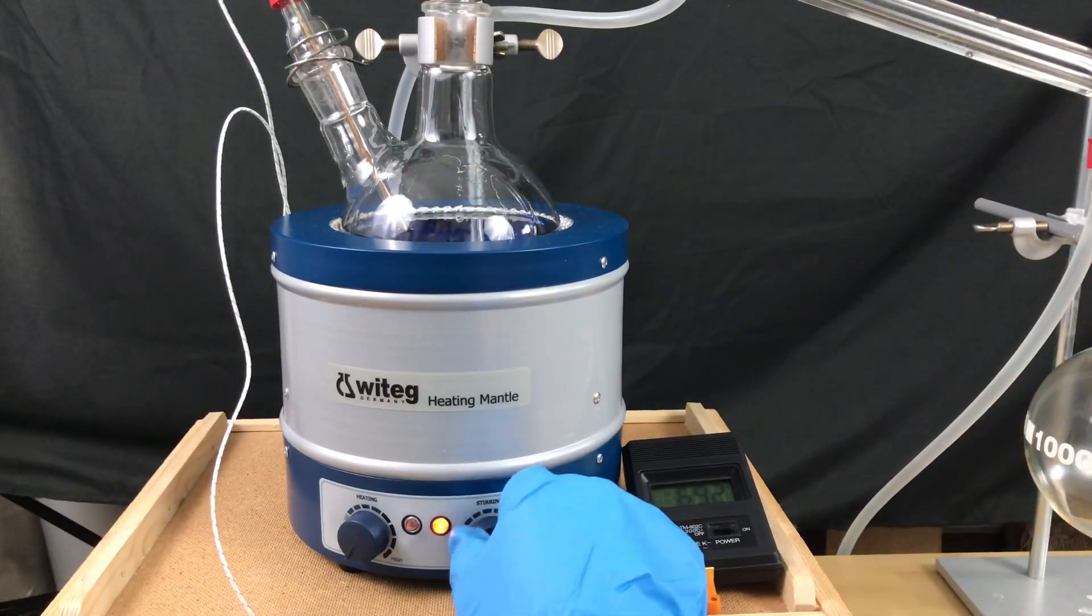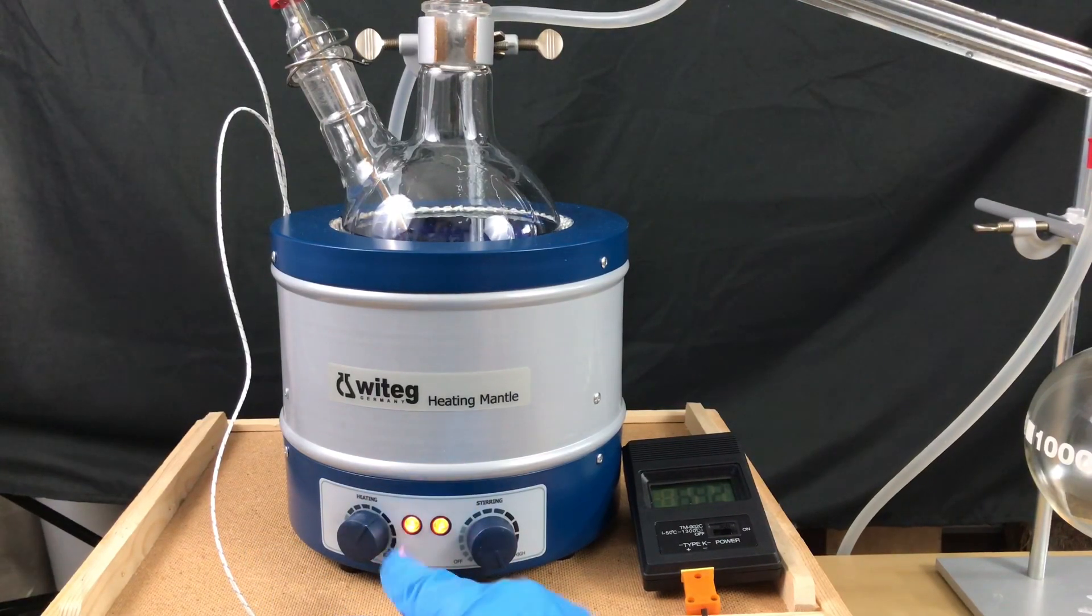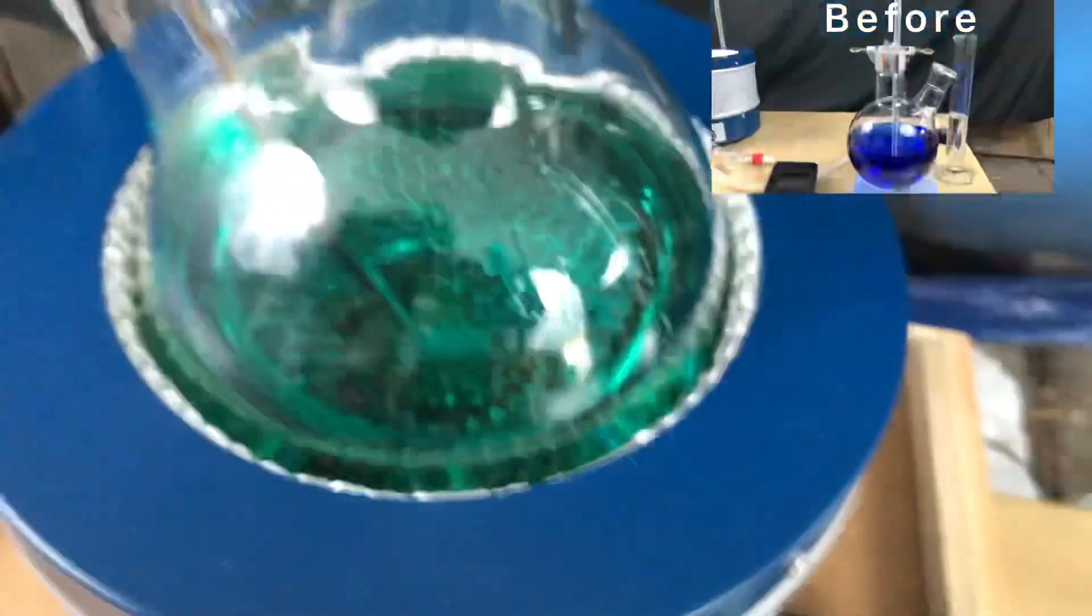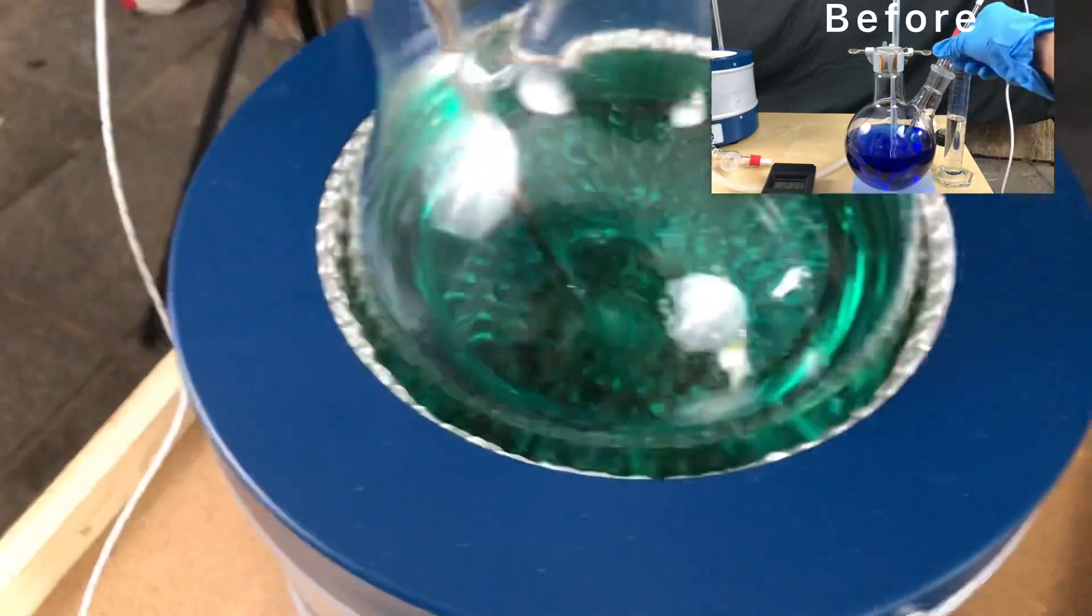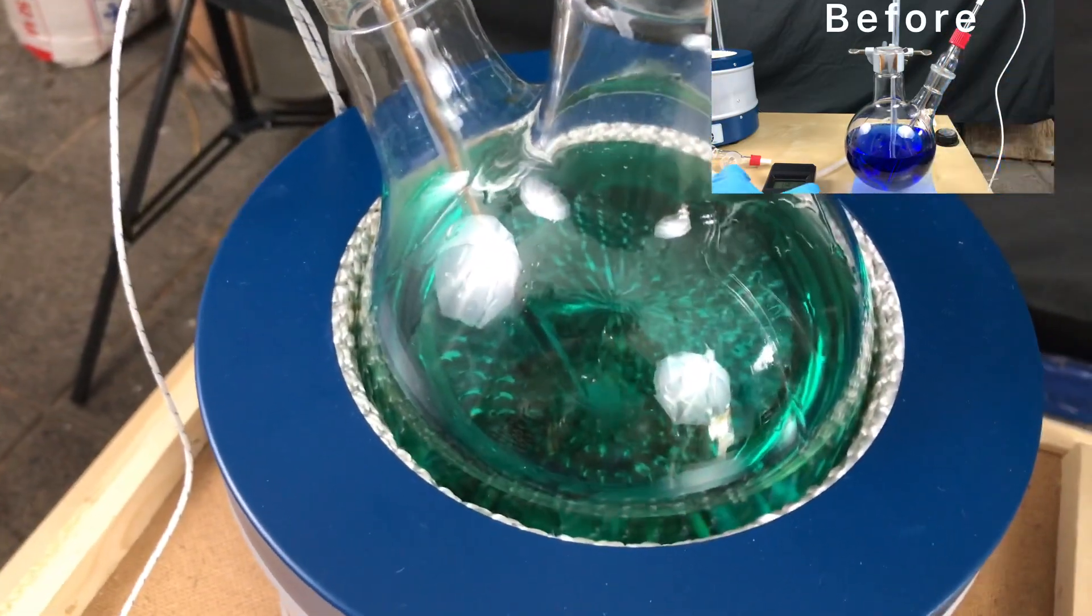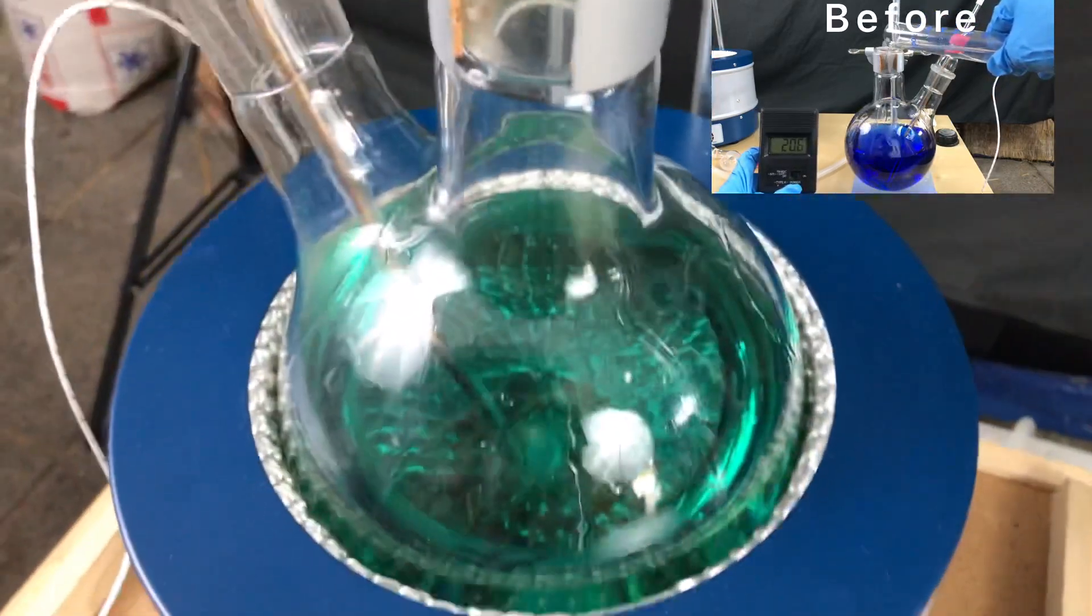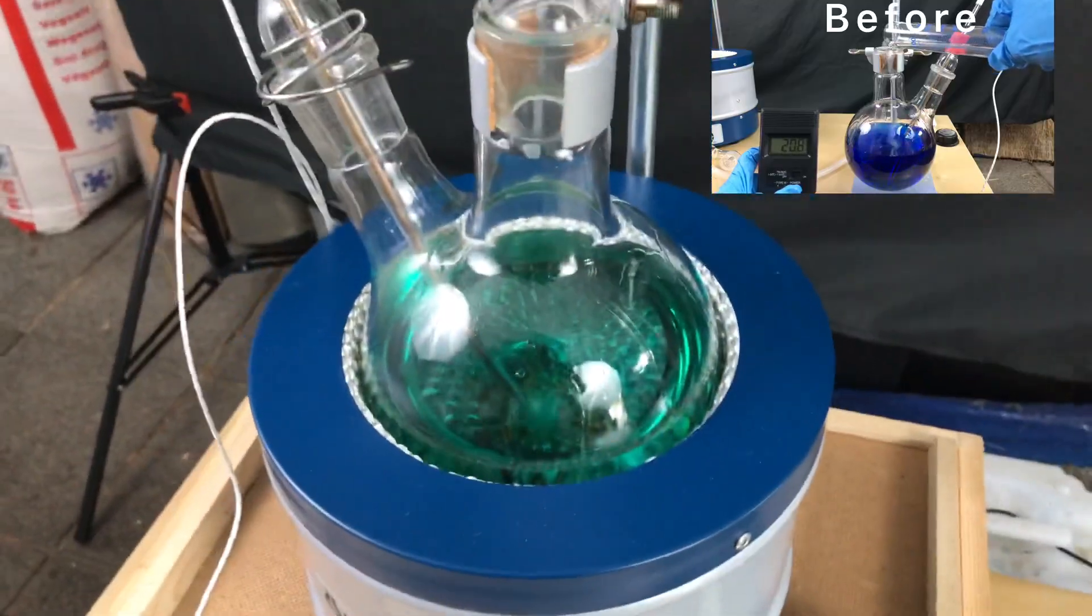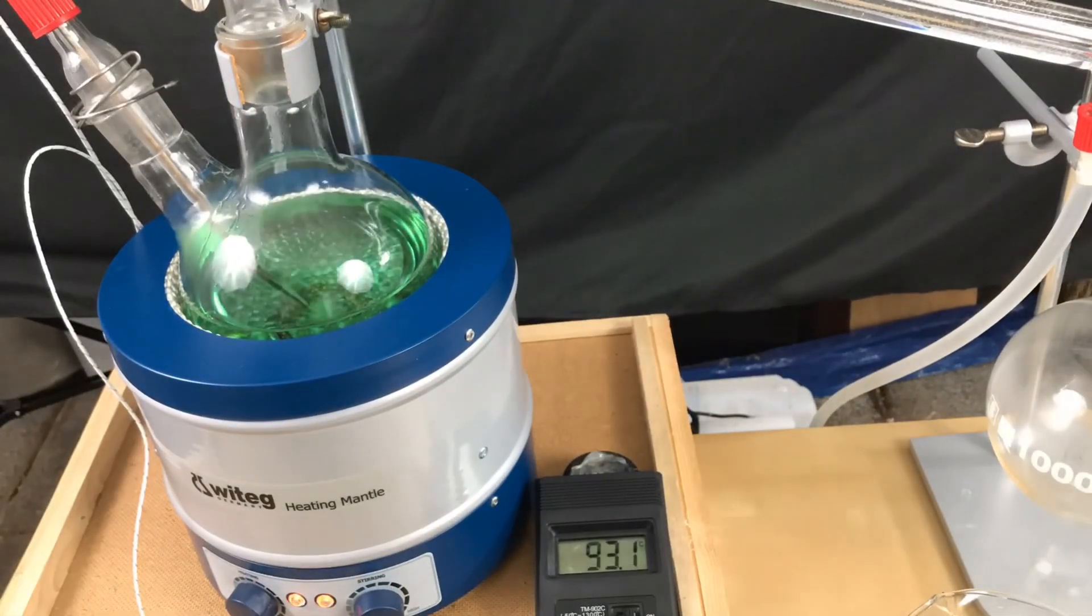We maxed out the magnetic stirrer to its fullest and turned on the heating. I want to note that our antifreeze had changed its color from a dark blue to a greenish color. The reason for this must be that the color reacted with the sulfuric acid. As the temperature rose the color changed even more.